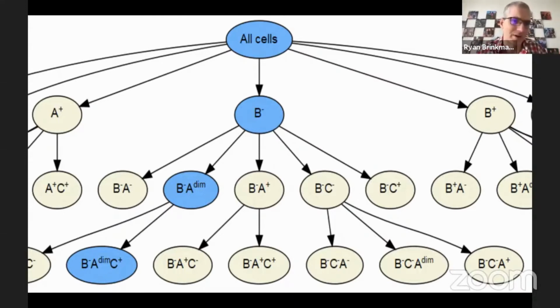We're writing Shakespeare here, right? If you have an infinite number of monkeys at typewriters, eventually they'll type enough to get Shakespeare out. Same thing here. Because we have so many engaged players, we can gate all possible bivariate combinations of gates and just go through the data all at the same time. And then at the end, we're not only going to get the populations that you wanted to find as a scientist, because they're going to be in that mix, we're going to find everything. And so this gives us the opportunity to do biomarker discovery with manual gating at an enormous scale.